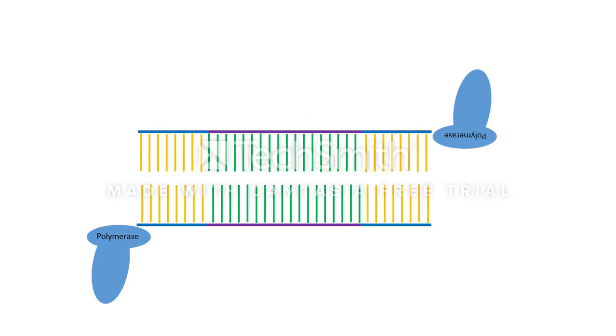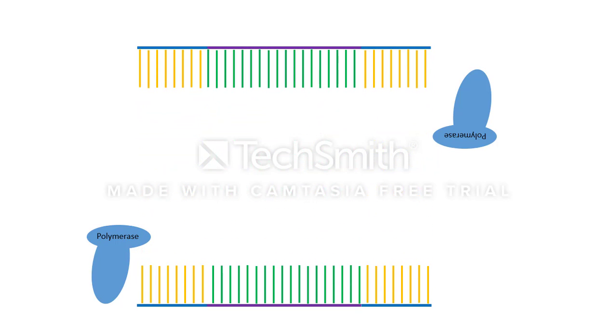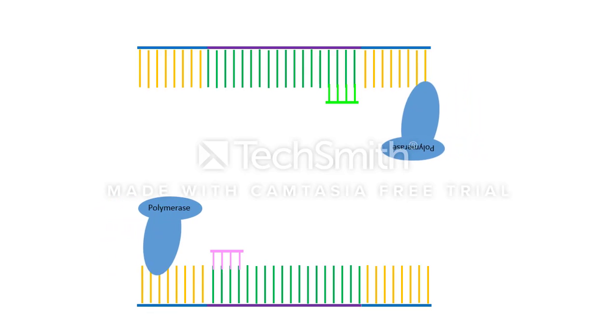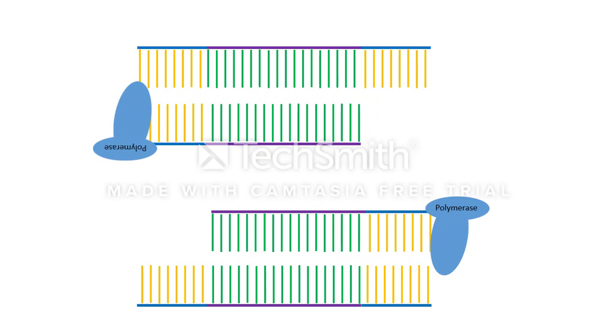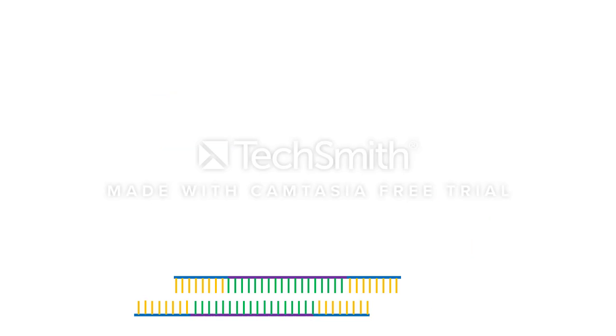During the denaturing process, the temperature is raised to 94 degrees Celsius, which allows the double-stranded DNA to separate. During the annealing process, the primers bind to the DNA at a temperature that is primer-specific. During the extension process, the polymerase binds to the primers and adds complementary bases, making a new copy of your desired gene. The extension time is product-specific, meaning that 30 seconds corresponds to about a 500 base pair product.